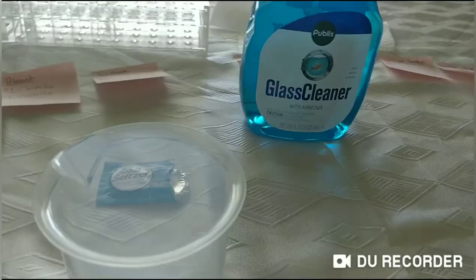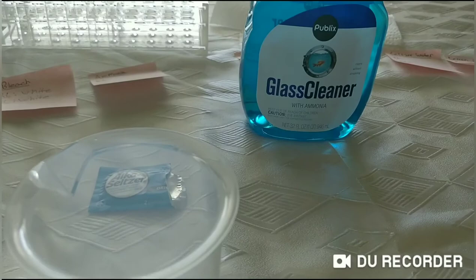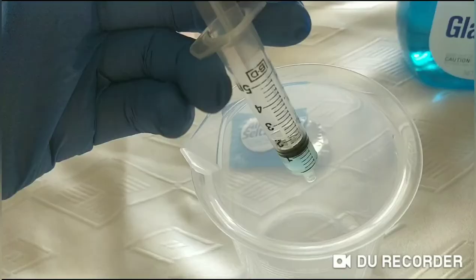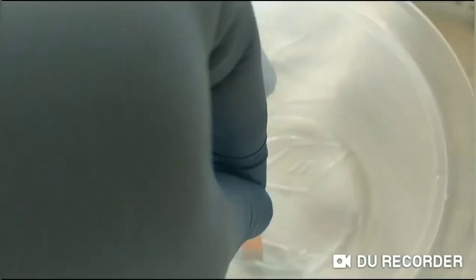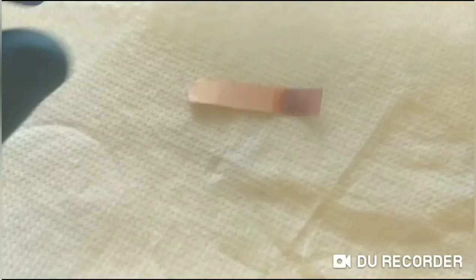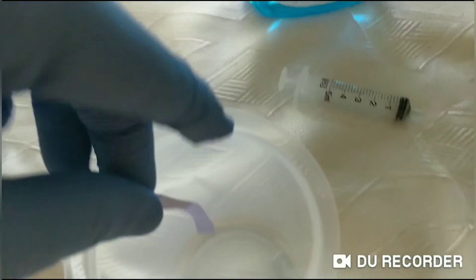For ammonia the best thing I could find was this glass cleaner with ammonia in it. I've sprayed a bit into the beaker and I'll measure one milliliter to test. I'll put the ammonia in the beaker and test it with the red and blue litmus paper. The red litmus paper turned blue. With the blue litmus paper it seems to stay blue.